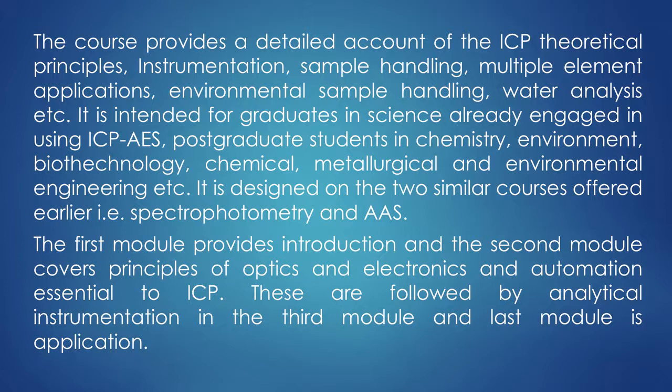It is designed on 2 courses which I have offered earlier, on spectrophotometry and atomic absorption spectrometry. If you wish, you can go through those 2 courses. I have divided this course into 4 modules. The first module is the introduction, and the second module covers the principles of optics and basic electronics, automation, computer, etc., fundamentally required in any instrument.